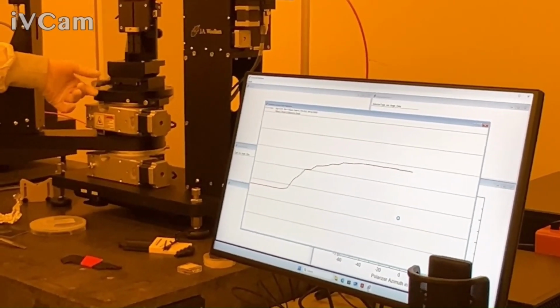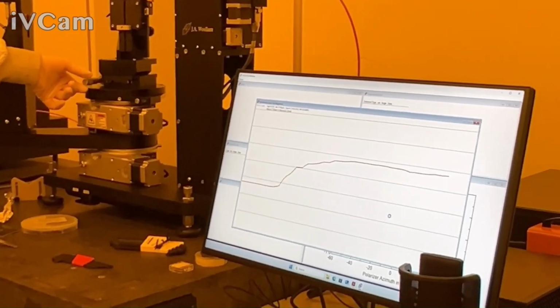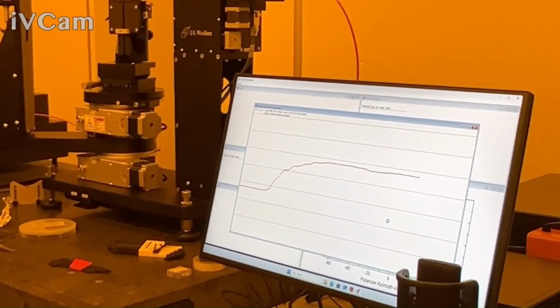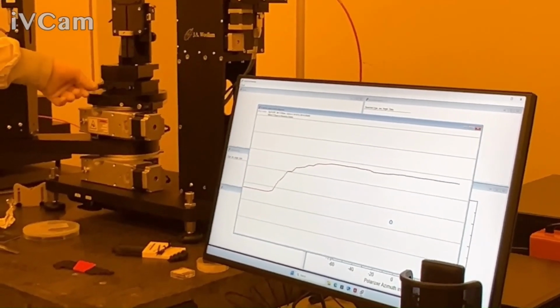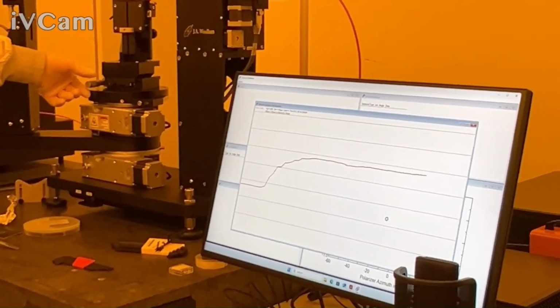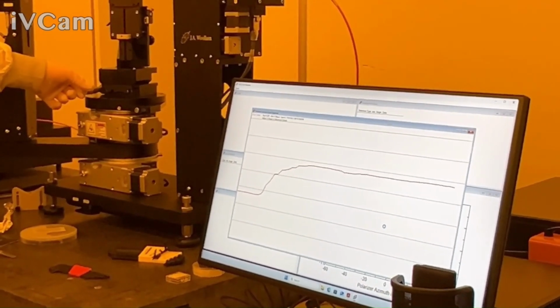And here, since the beam is smaller than the aperture, you'll have more of a plateau, more of a flat area. So usually what I do is I go both directions until it starts coming down, and I try to stop, come back in the middle. Because the beam is smaller than the aperture now, you're going to have an area where you can go both ways on the spot.